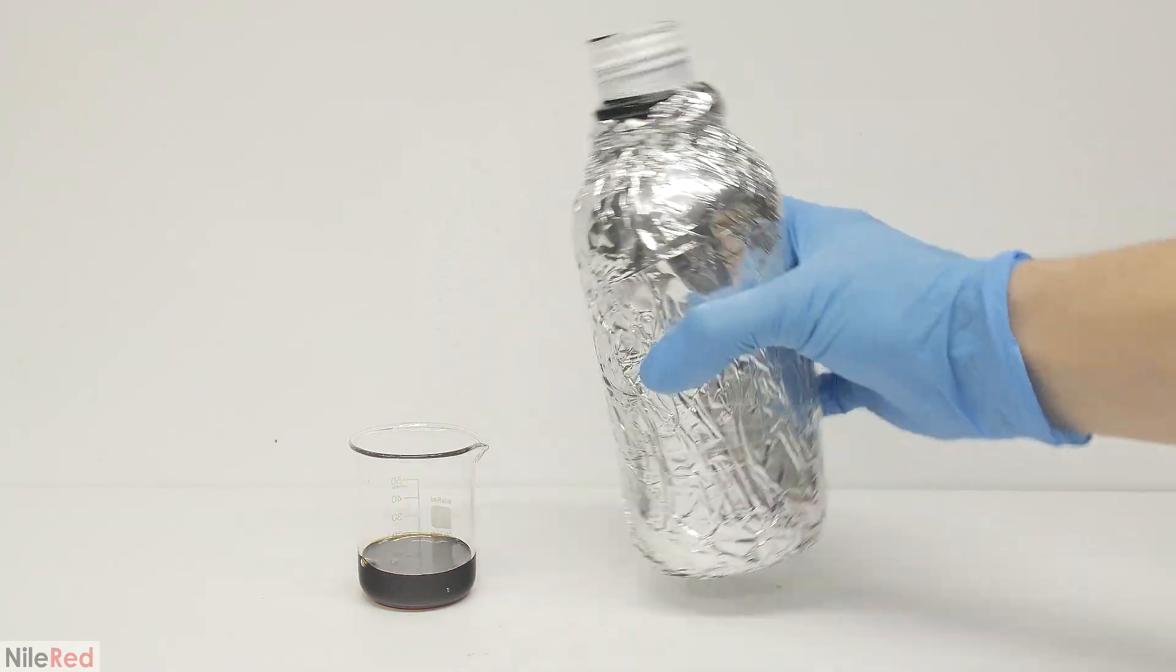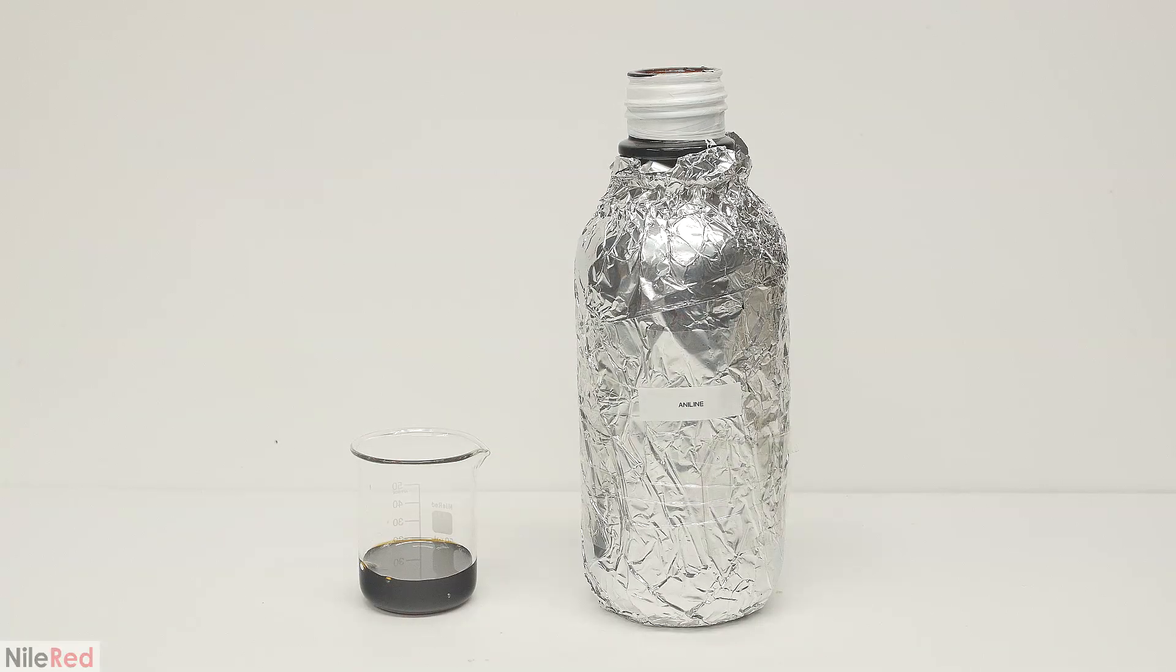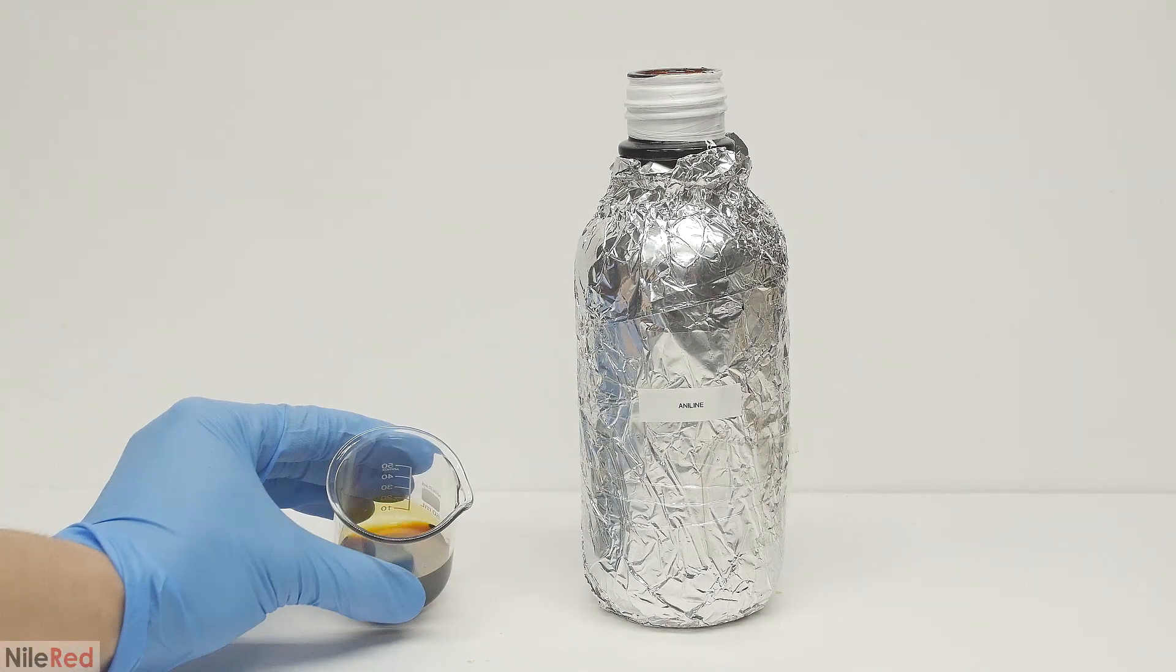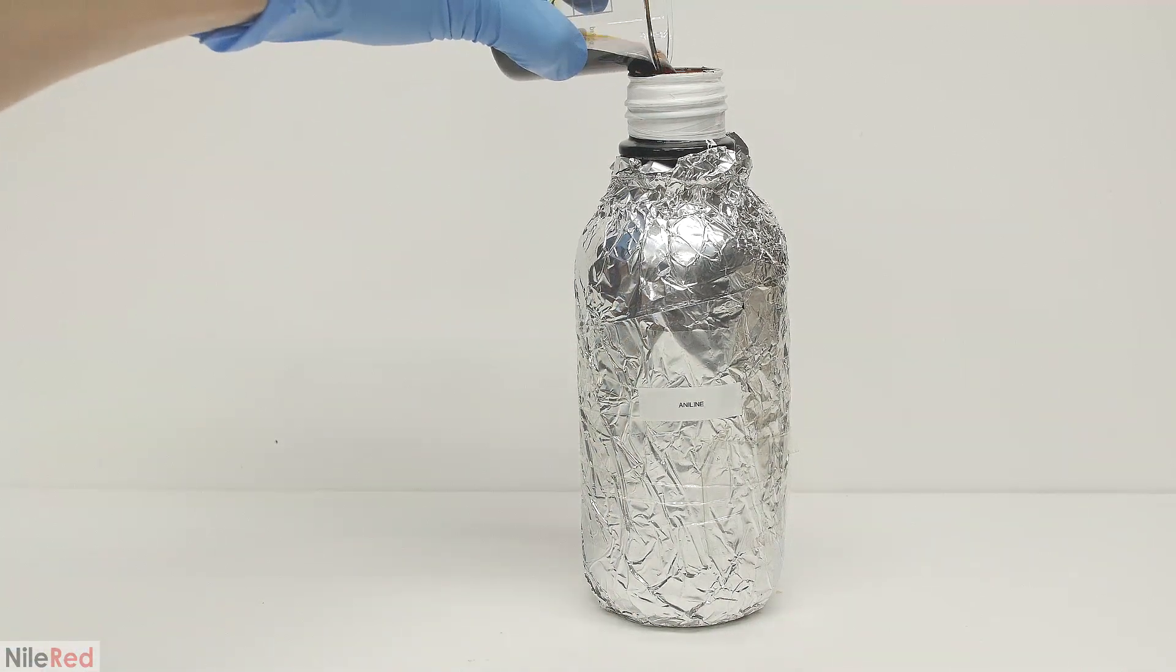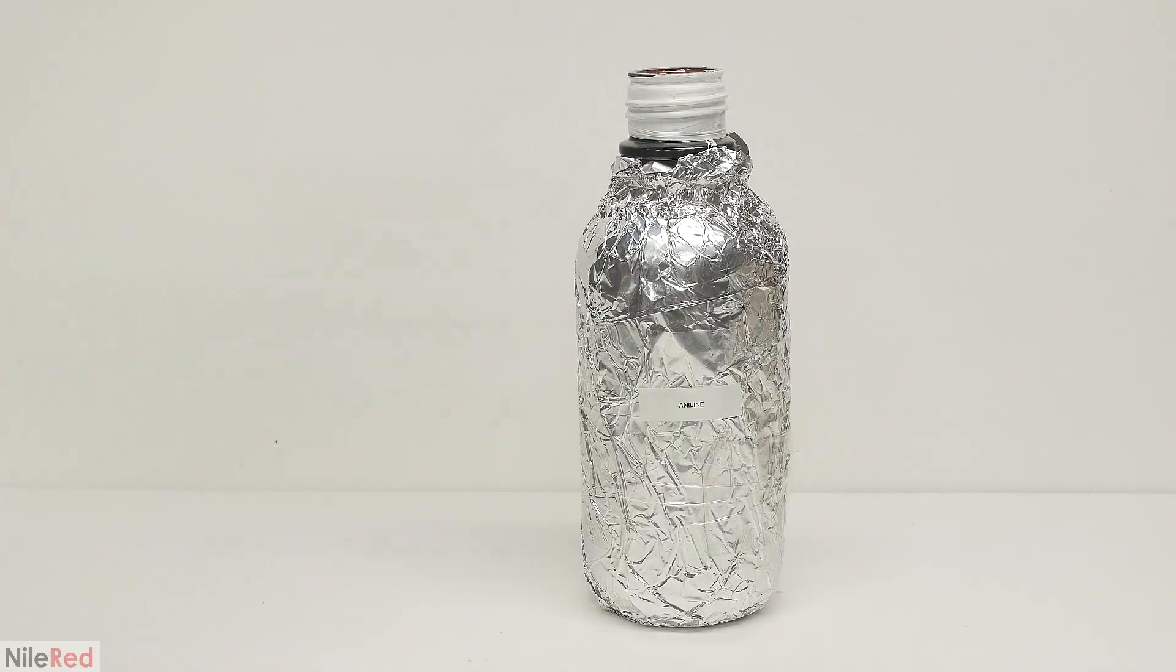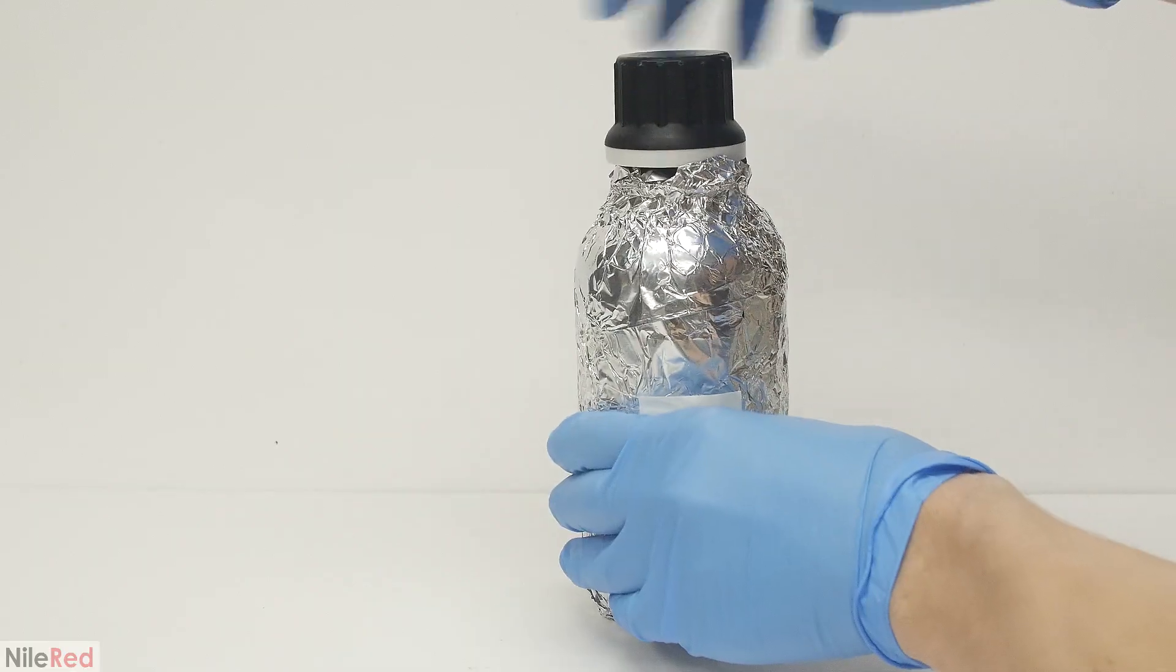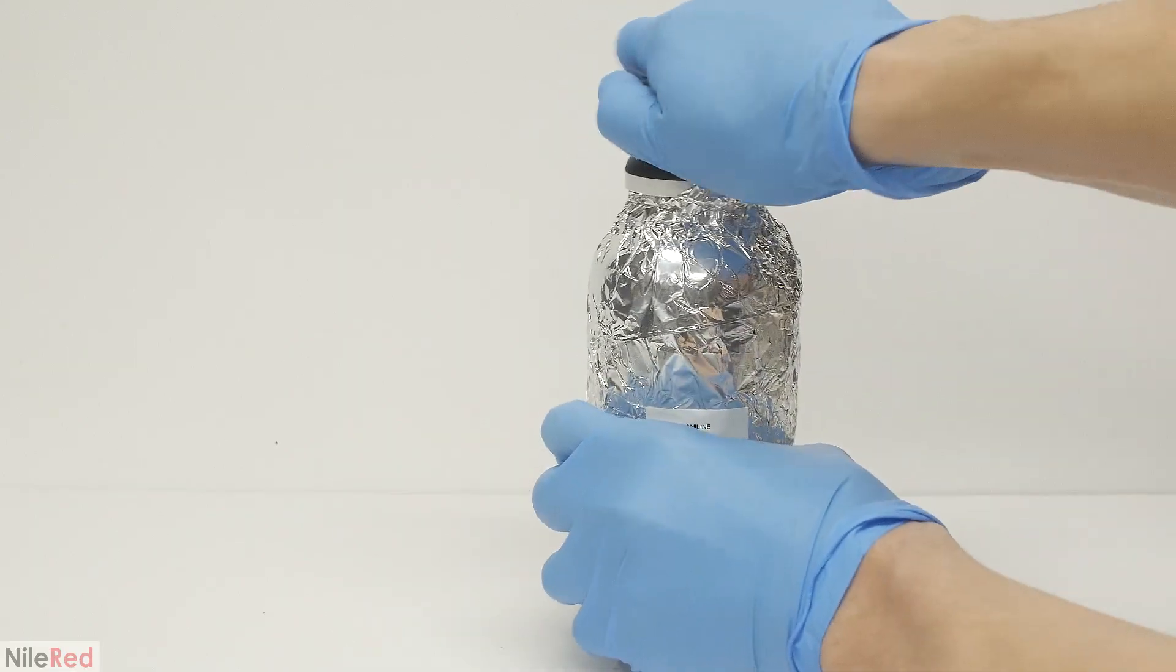Over time, and prolonged storage, aniline tends to degrade, so before I get started, it's a good idea to check the quality of it. When aniline is pure, it's either colorless or slightly yellow, but the stuff I have here is brown. Unfortunately, this means that it has degraded quite a bit, and before proceeding on, I need to purify it.